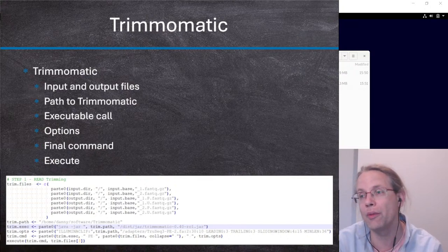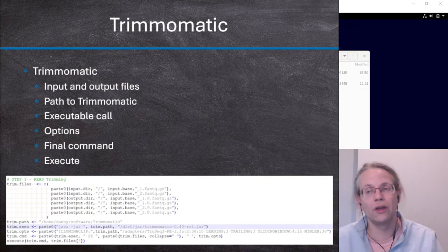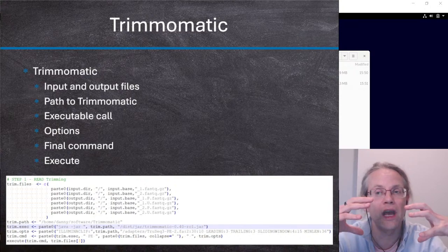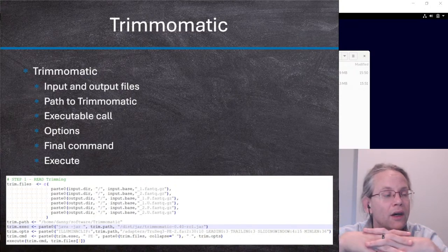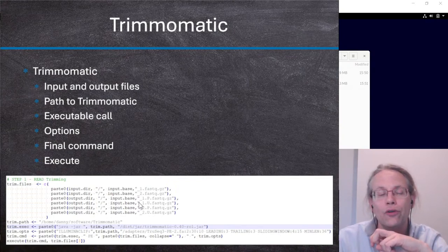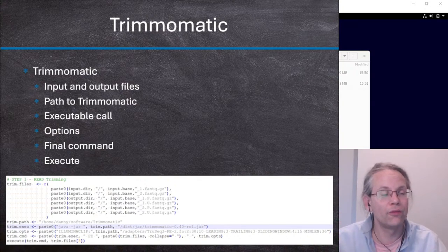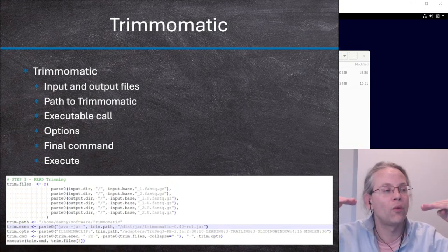The main issue with Trimmomatic is the CPU, because it trims a read, right? The only thing it does is keep an X amount of reads in memory, and then it writes them out to these four output files. So it's not like it's going to load in all of the reads and then start trimming. No, it will just go through the files one by one, right?